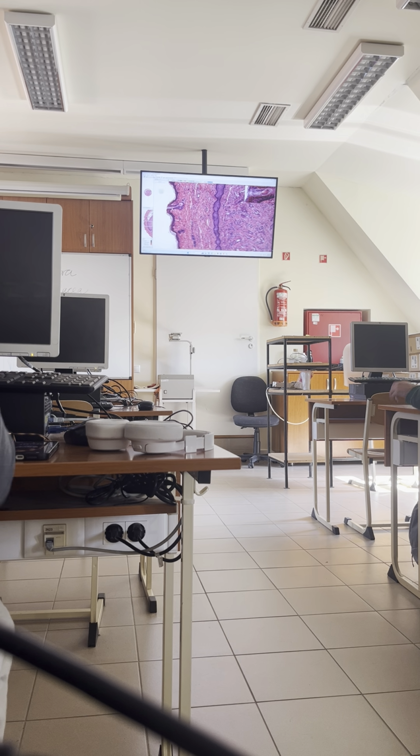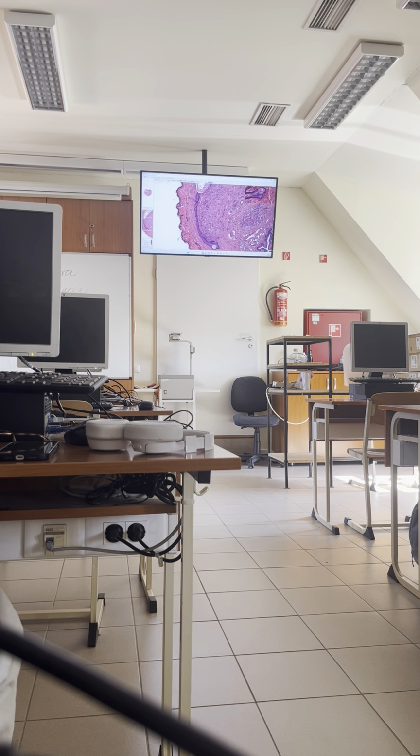No, this is not a hair follicle, this is just a sebaceous gland. Well, I wouldn't say no. It's a sebaceous gland. So this is the problem that you spotted, that this is said to be thin skin, but without really hair follicles. Biological nomenclature. Hate it.